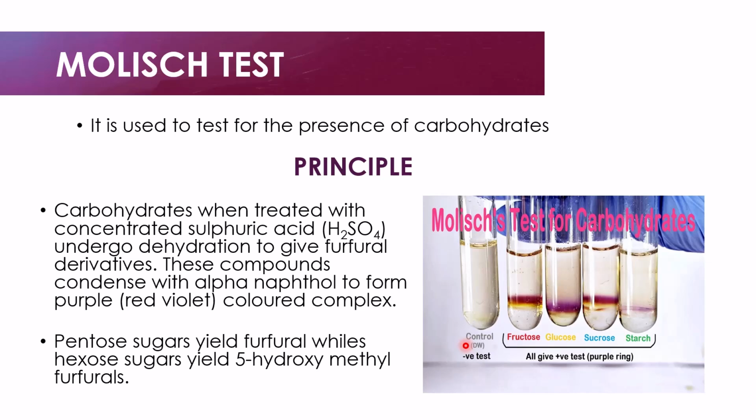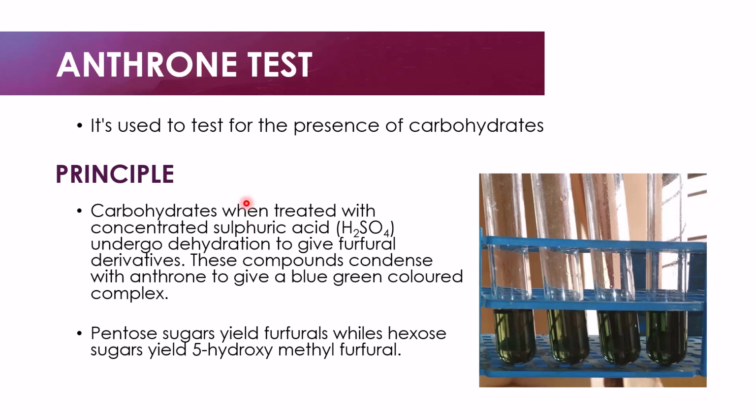Anthrone test. Anthrone test is used to test for the presence of carbohydrates. Principle. Carbohydrates, when treated with concentrated sulfuric acid, will undergo dehydration to give furfural derivatives. And this compound condenses with anthrone to give a blue-green colored complex.